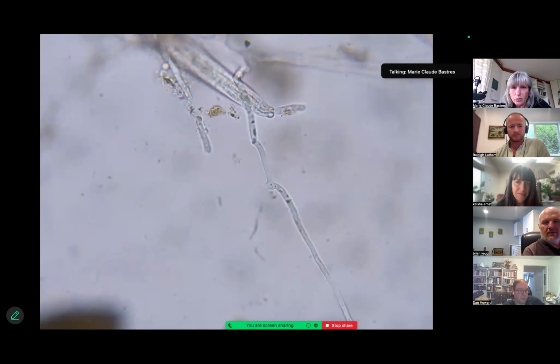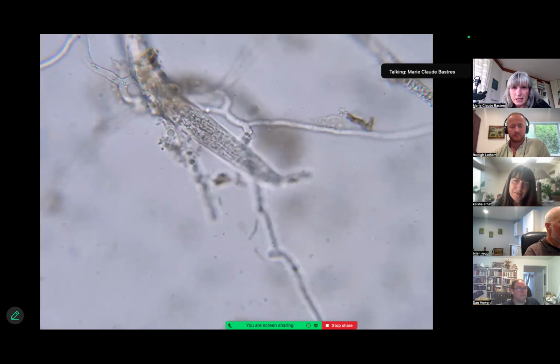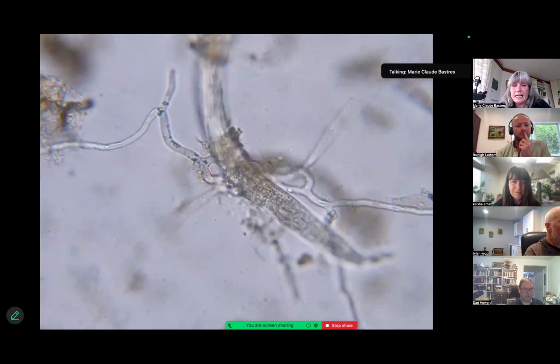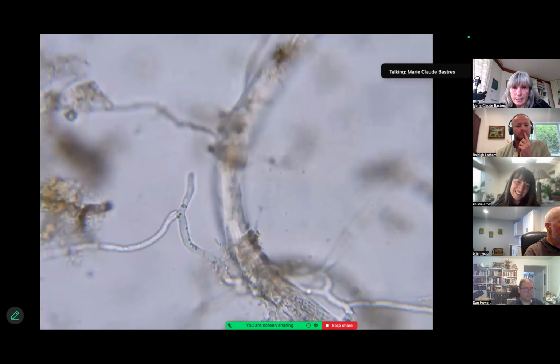So I am looking at how it grows, and it grows quite like an Oomycetes fungi with bubbles, and it makes some rings. And that's where the nematode, and it is a very big nematode, was trapped and died.